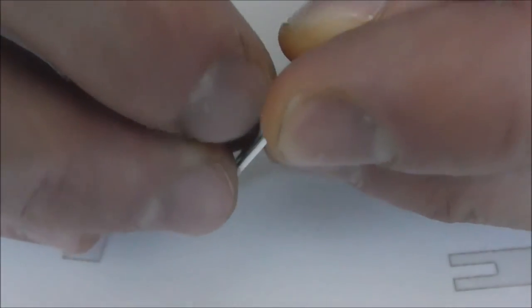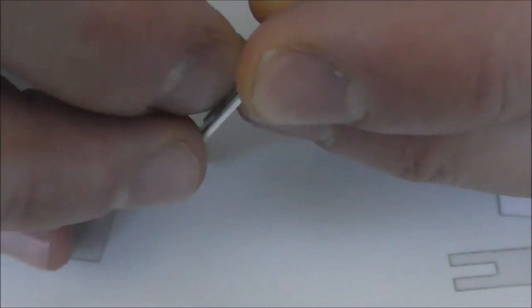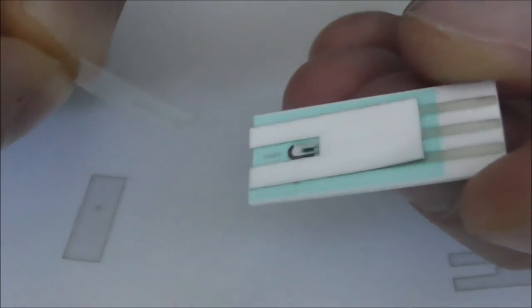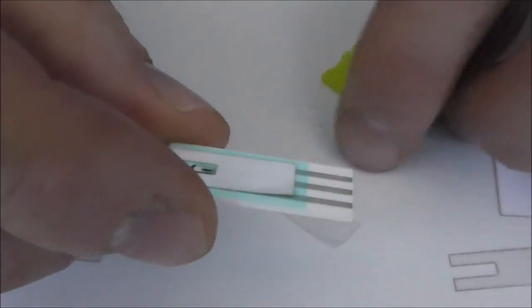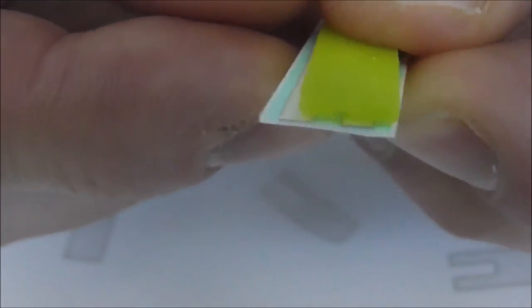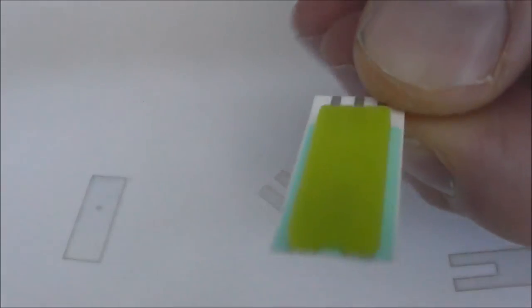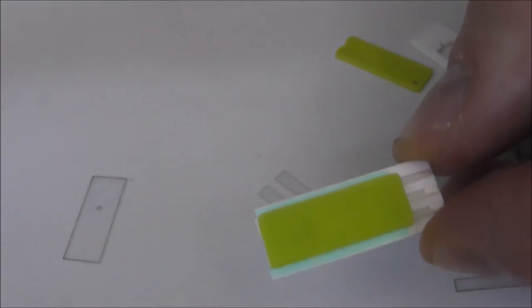Now what I'm going to do is peel off, I've peeled off another backing layer and I'm now going to make the sensor by adhering this to there. So I'm adhering this to there and there we are, we've now, once I've pushed that down, now we've made an end fill sensor. Okay, simple as that.